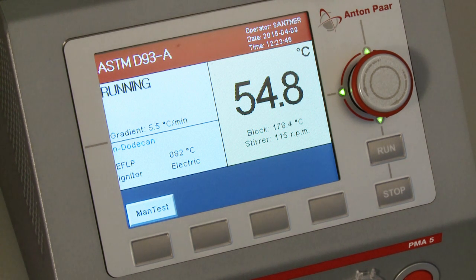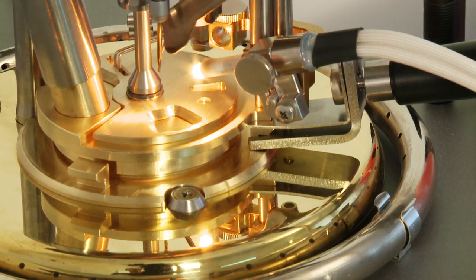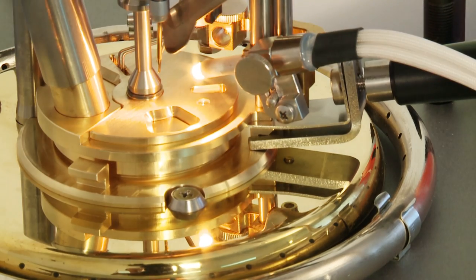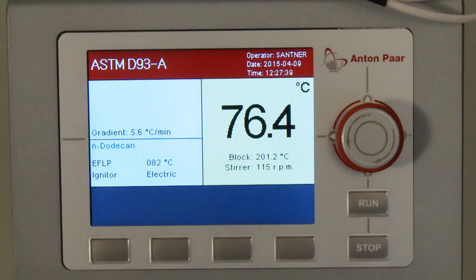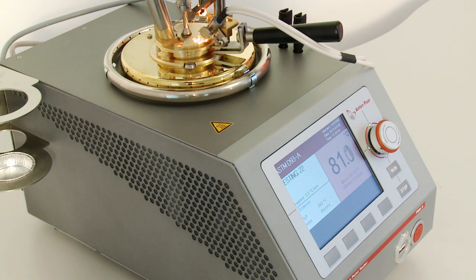Why has the color on the display just changed? Good question, Tony. To help users instantly and easily check their test progress, PMA5 displays its values with a color code. While you get closer to the expected flashpoint, the color changes from green to yellow to red, and again changes color once the flashpoint is found.